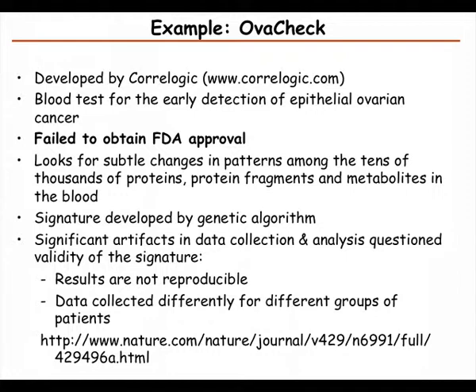The way this was done was with a variation on matrix-assisted laser desorption mass spectrometry. You would mix a matrix with your sample, put it on a surface, and then shoot a laser light, and then look at the ions. You didn't have any separation, or only very little separation, so you would have all the proteins from serum that you would analyze. So you got peaks, you didn't know what the peaks were, and they were probably often many proteins together.